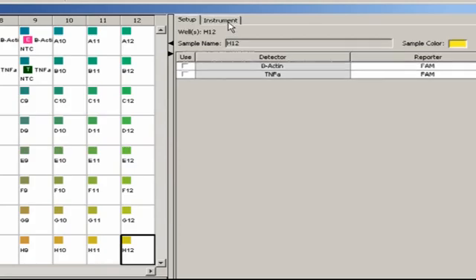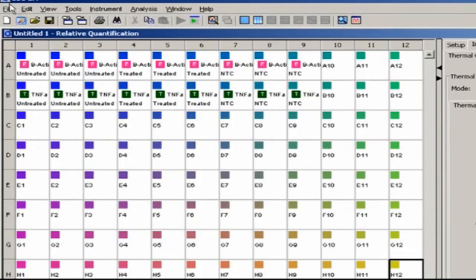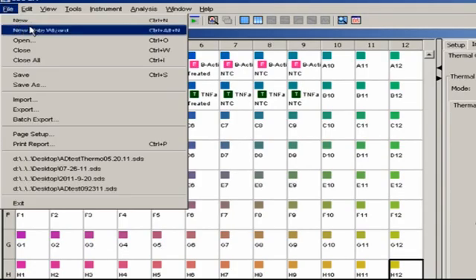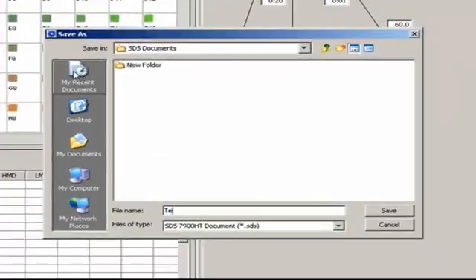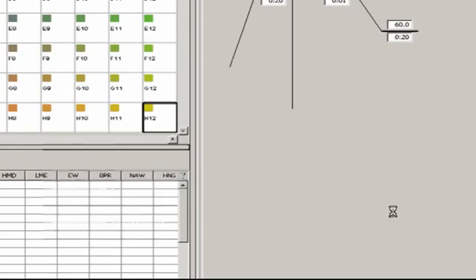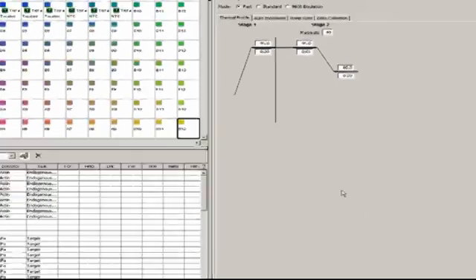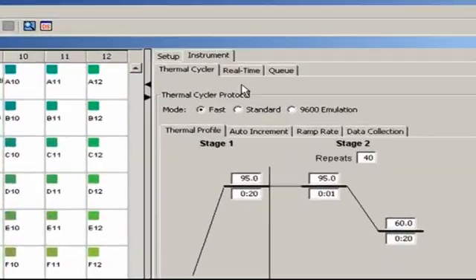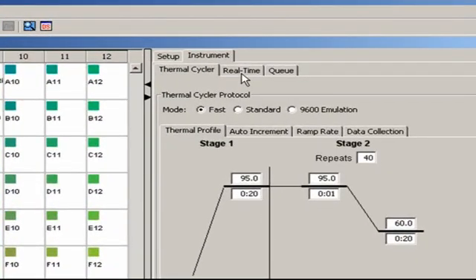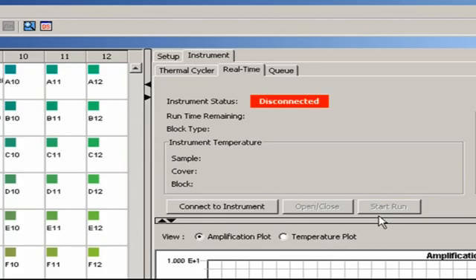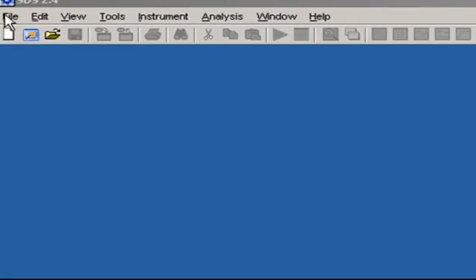Go under Instrument to be sure that the run conditions are correct. Assuming they are, save the file by going to File, Save, and entering a unique file name. Navigate to the folder of choice and click Save. Next, with the plate loaded in the machine, hit the Real Time tab, where if I had an instrument connected to my computer, which I don't, I'd be able to click the Run button to initiate cycling.